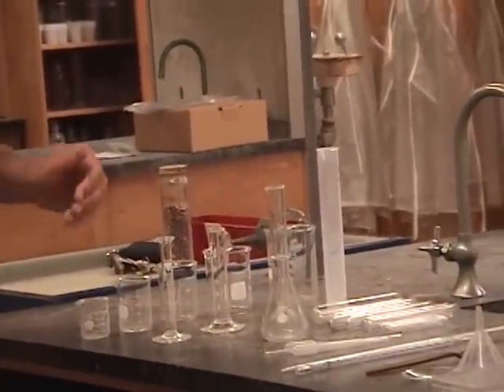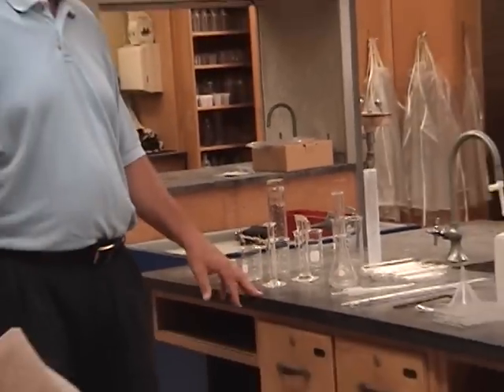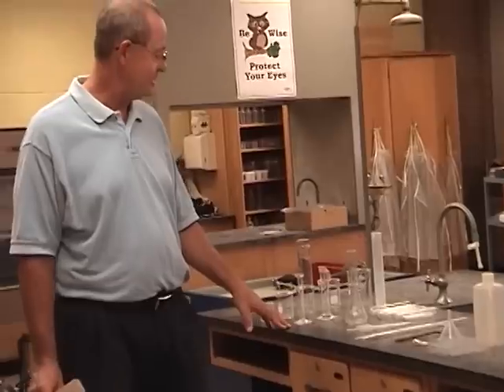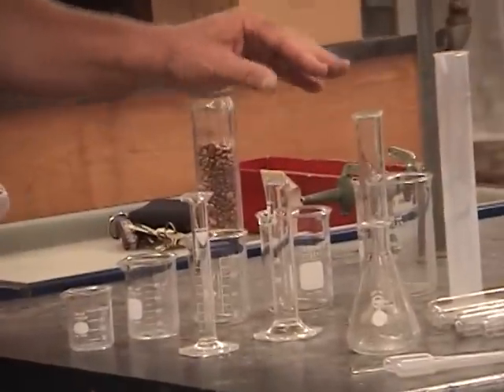We also have four graduated cylinders. 'Graduated' means to mark or to grade, and they are cylindrical in shape — that's where the name comes from. They have markings on them to measure volume. We have the 10 mL, the 25 mL, the 50 mL, and the 100 mL.